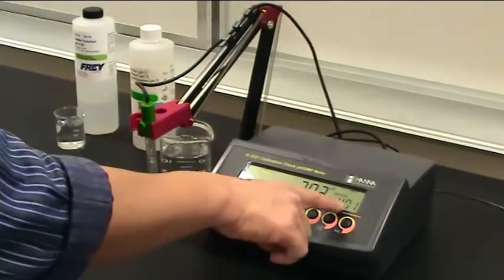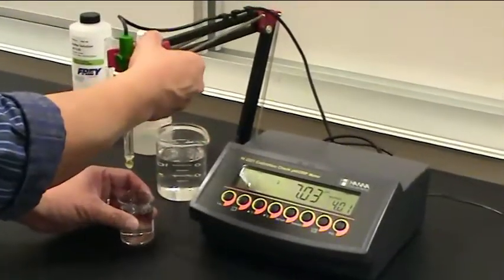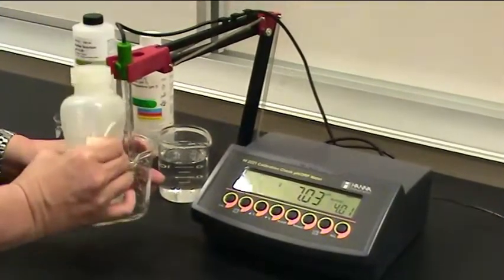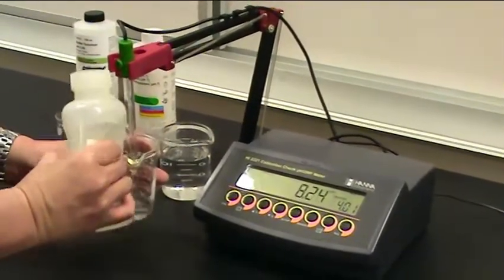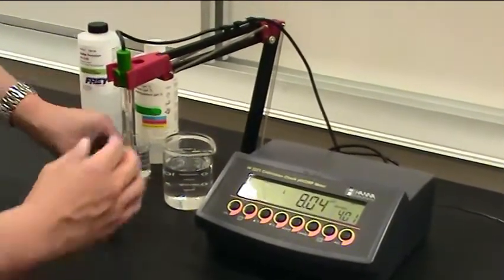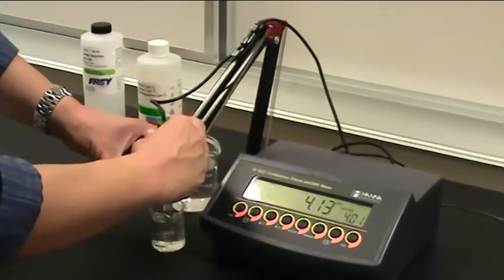Now you'll see that the buffer number changes to 4, and now you're going to switch over to the pH 4 buffer for referencing. So again, make sure you remember to rinse off the probe between solutions. And then go ahead and put the probe into pH 4 and let it equilibrate.